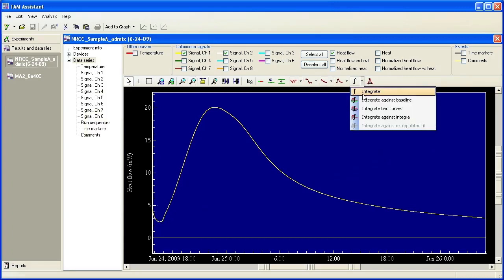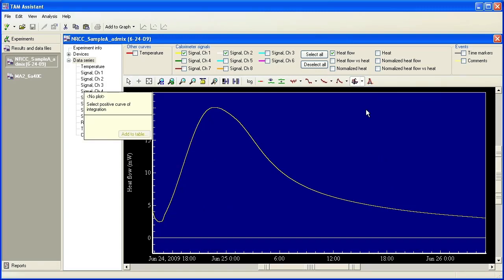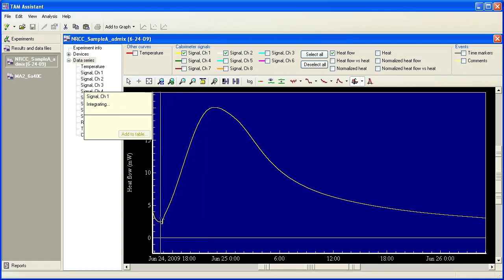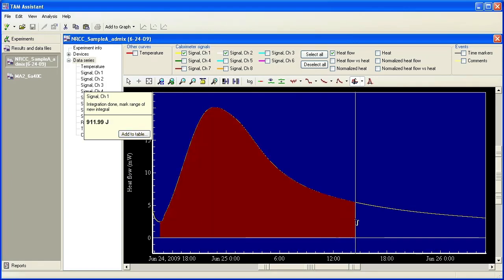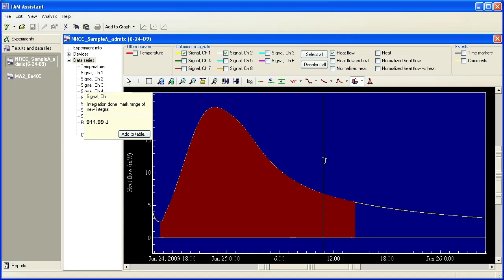There's another way to integrate, choosing integrate against two curves. It asks you to select a positive curve and then it asks you to select a negative curve and then you get this line that shows up. If you click and drag, you see that you have this integration that's from the negative curve to the positive curve and it shows here. If you were to do this in a report file, you would have a text box that would save this integrated value.